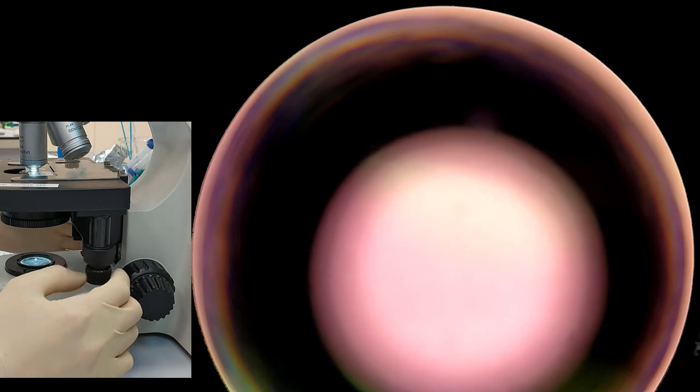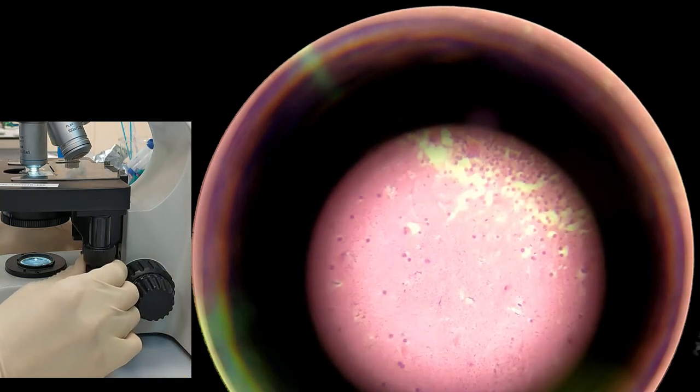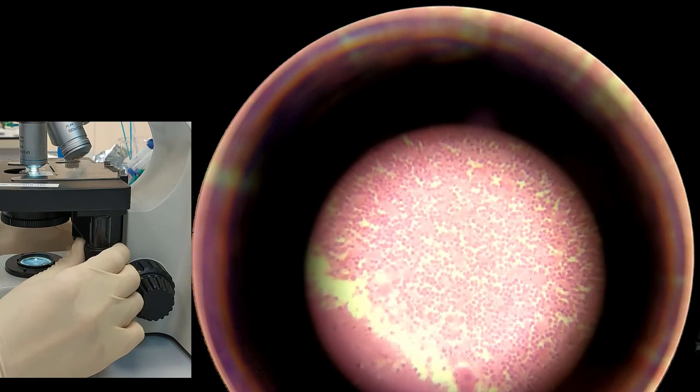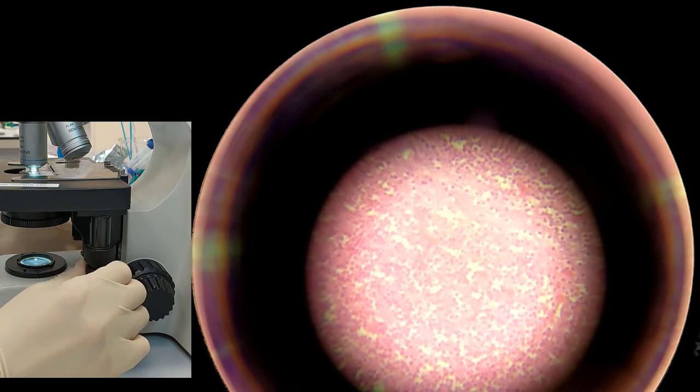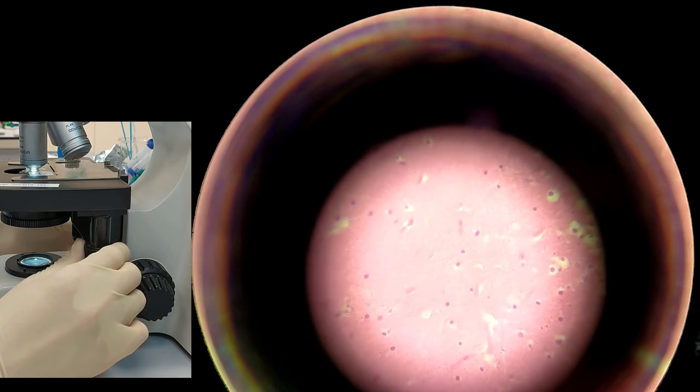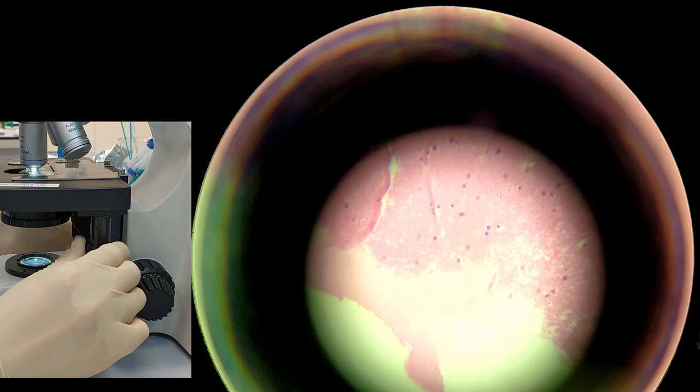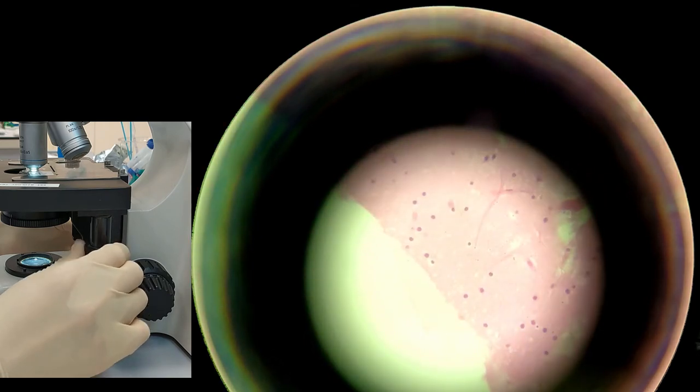Okay, so here you can see the cells. This is the section of the cerebellum. These are the neurons, and the white tissues, the white substance, are the axons of these neurons.